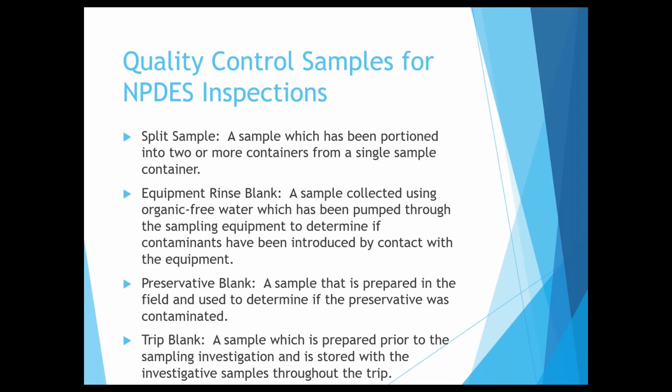We put the lid on, and we want to make sure that the DI water is clean and the preservative isn't providing an influence on our sample.